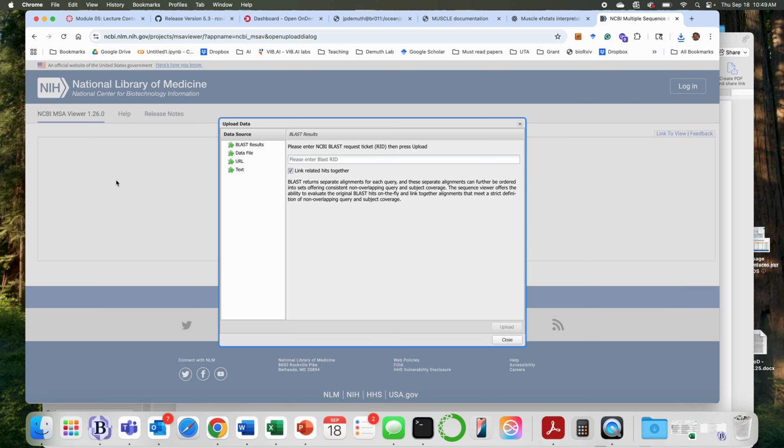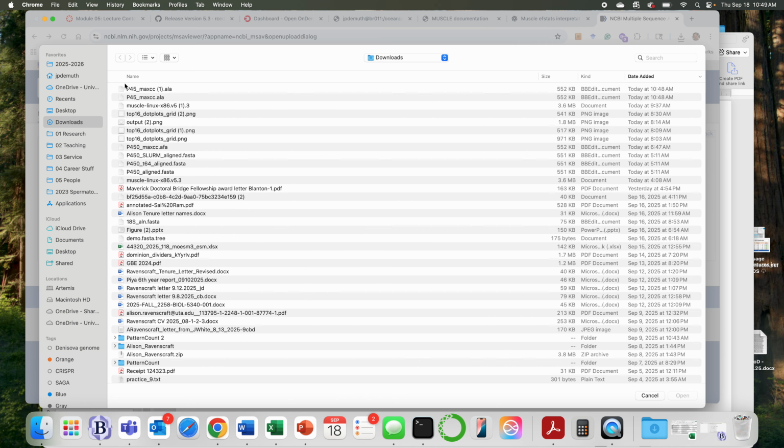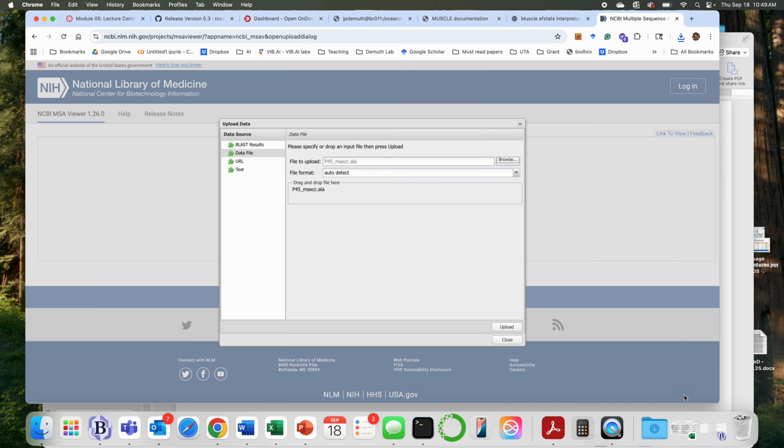We're going to click upload data file and then browse our machine for that. So pick my P450. It says P45. Apparently I missed a 0 there. And upload. I just let it auto-detect a format. It doesn't get this wrong.